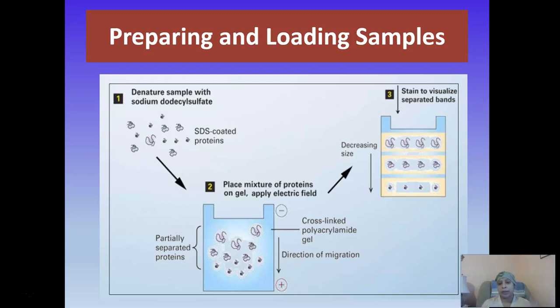Then we're going to do what we did before. We're going to denature our samples using that SDS loading buffer, heating it up to break them all down, make them all linearized, and then you're going to be loading them onto your gels and running them on the electric current. Again, we initially like to run it a little bit faster to stack them in the stacking gel really nice and crisp, and then lower the voltage a little bit so it can resolve slowly and cleanly and crisply. You don't want to go too slow, you don't want to go too fast.